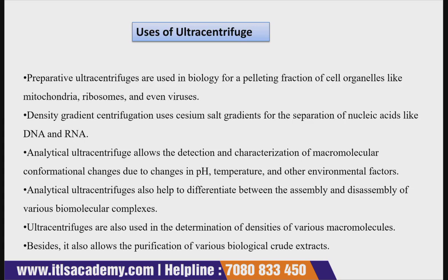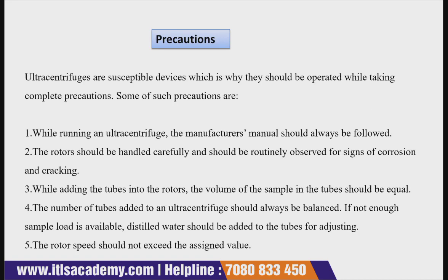So it has a great application in biology labs, chemical labs, biochemical labs, and all the laboratories have this technique. Why? Because it operates on a sedimentation principle, allowing the separation and purification of molecules. And it has a great application in biology for pelleting fractions of cell organelles like mitochondria, ribosomes, and sometimes even viruses. So these are the uses. You should always know the uses of ultracentrifugation.